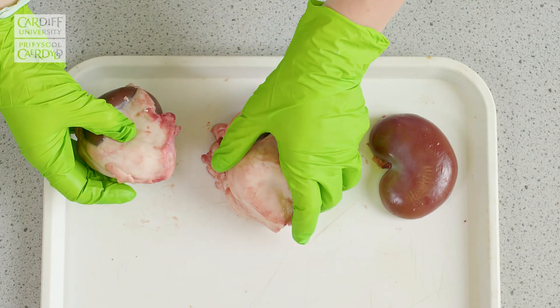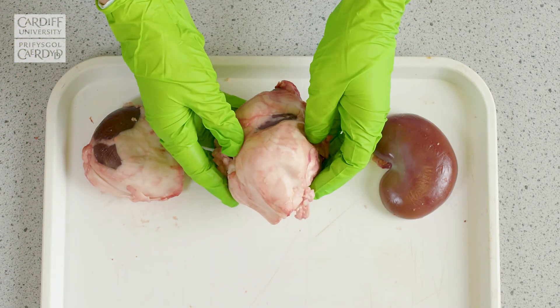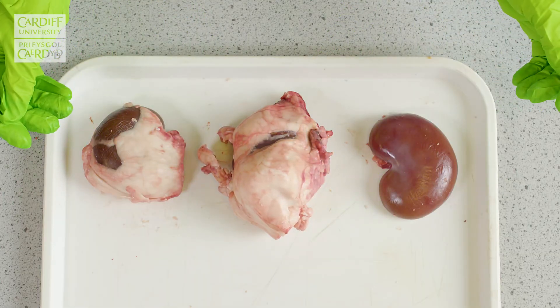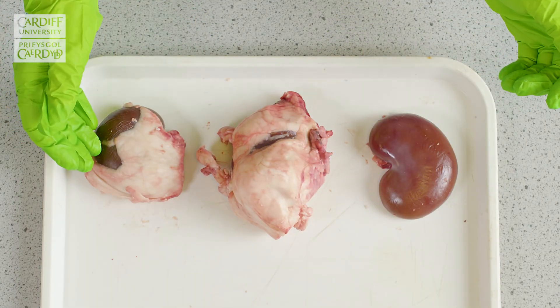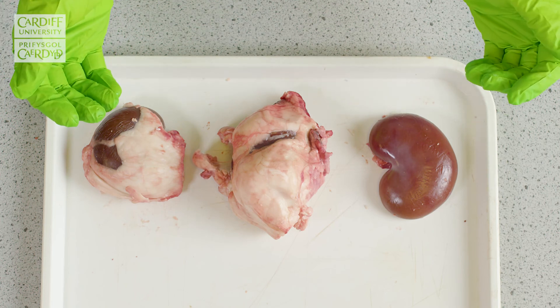I thought it'd be good to show that sometimes they're surrounded in less fatty tissue and sometimes they're surrounded in more fatty tissue. But we have found that it's easier to carry out the dissection with the fatty tissue around it, as it gives the kidney a bit more support when you're carrying out the dissection.